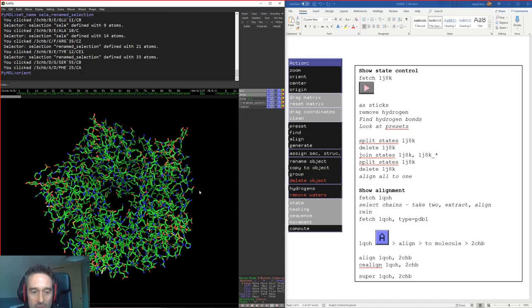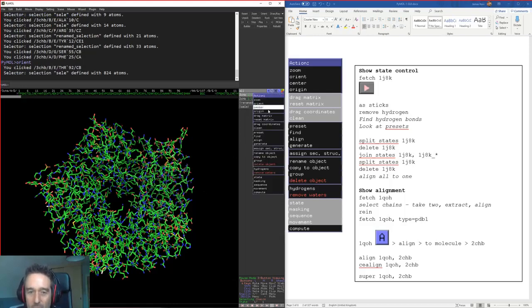But what you could do is have it rotate around here, and then things get a little bit crazy. So I wouldn't bother using those. I'd just use zoom and orient if you like. We don't need to talk about matrices. We can talk about the presets here.